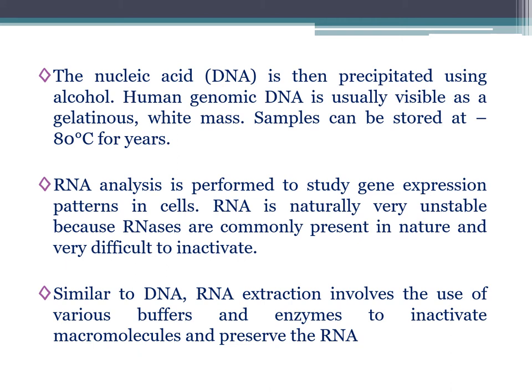RNA analysis is performed to study gene expression patterns in cells. RNA is naturally very unstable because RNases are commonly present in nature and very difficult to inactivate. These RNases can degrade RNA. So, for RNA analysis, first it is needed to inactivate RNases. Similar to DNA, RNA extraction also involves the use of various buffers and enzymes to inactivate macromolecules and preserve the RNA.